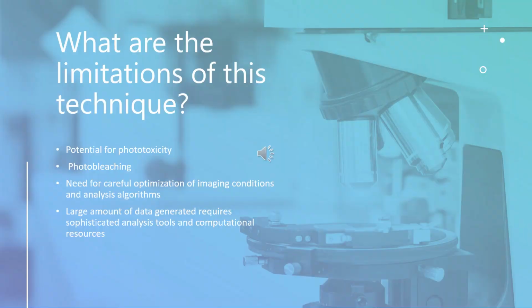The limitations of high-content microscopy are the potential for phototoxicity and photobleaching. Phototoxicity is damage to cellular macromolecules upon excitation, which can impair sample physiology and lead to sample death. Photobleaching occurs upon illumination with high laser power over prolonged periods of time. The imaged organisms are damaged, and there is a decay of fluorescence intensity caused by light excitation. Basically, it is due to the prolonged exposure of cells to excitation light during image acquisition, which can affect cell viability and result in inaccurate data.